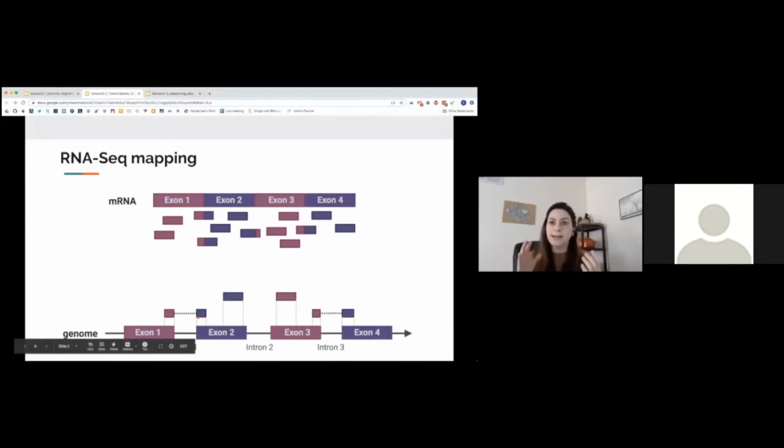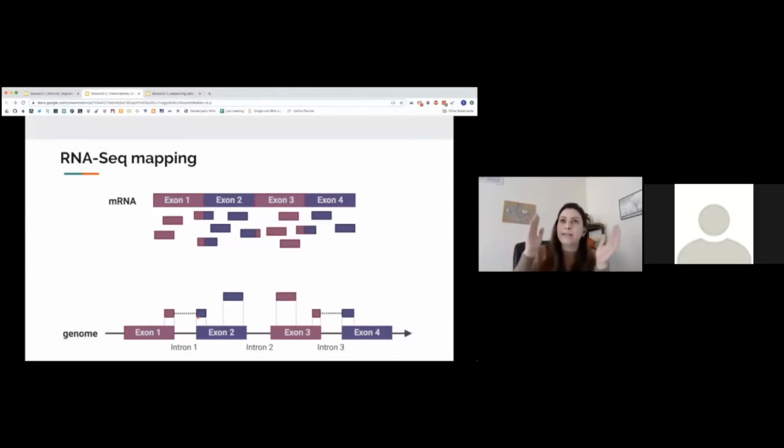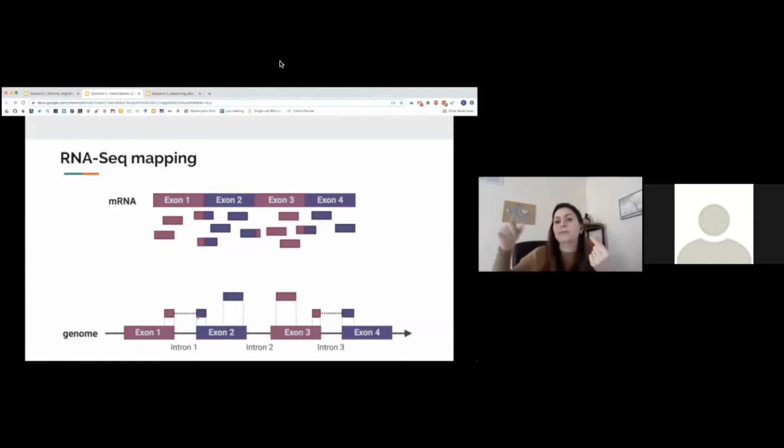The hash indexing will serve for any base in the genome. It will have every base in the genome, what words, and where you can find those words. But it's not the same as splicing aware. Splicing aware means it's able to handle large gaps, hundreds of kilobases large. And it's still capable of taking that second piece and finding a new position in the genome, that could be hundreds of kilobases away, that aligns the remainder of your read. Sorry, I hope I didn't confuse you further. Let me know if you have more questions.